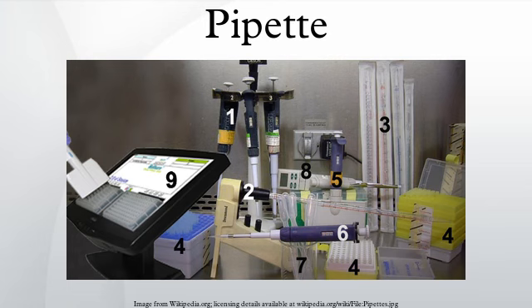Graduated pipettes. Graduated pipettes are a type of pipette consisting of a long tube with a series of graduations, as on a graduated cylinder or burette, to indicate different calibrated volumes. They also require a source of vacuum. In the early days of chemistry and biology, the mouth was used. Graduated pipettes commonly come in 5, 10, 25 and 50 milliliter volumes. To avoid accidental ingestion of potentially harmful substances, a variety of propipettors have been developed, both entirely manual and electrically assisted.